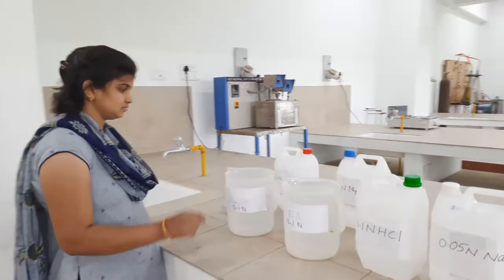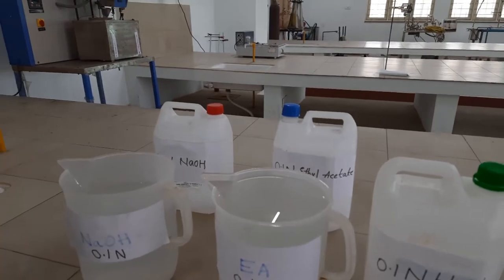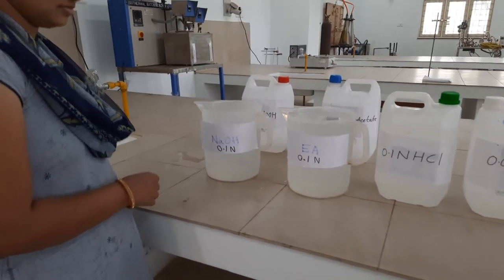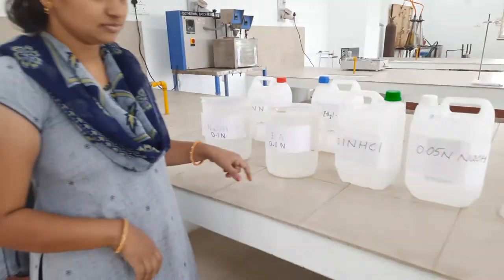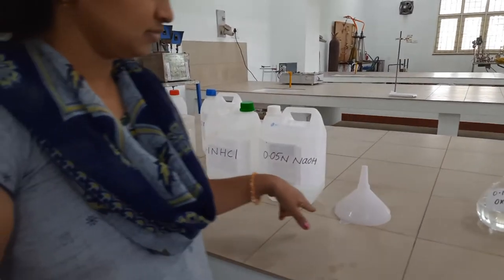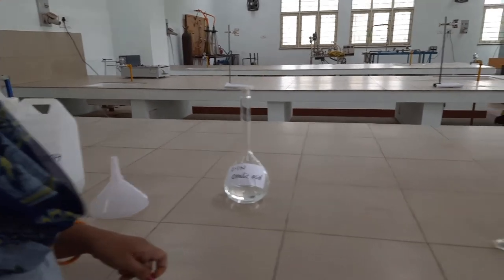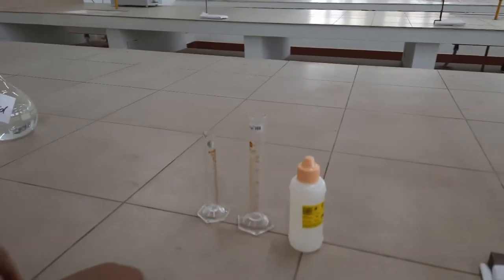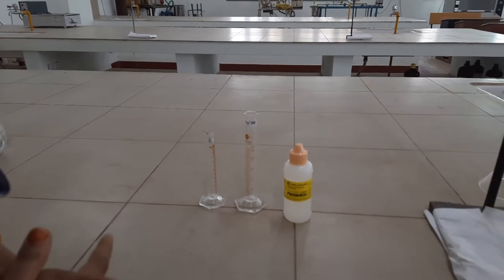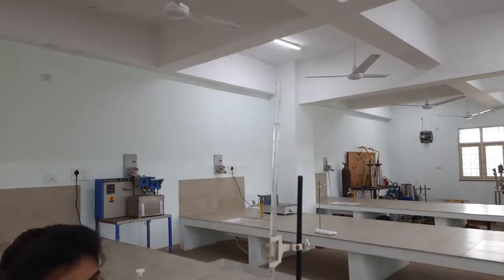Apparatus and chemicals required. To start with, for batch reactors, we prepared a small amount of 0.1 normal NaOH and 0.1 normal ethyl acetate. But for continuous reactors, we need to prepare more, so we prepared around 5 liters of 0.1 normal ethyl acetate and 0.1 normal NaOH. For titration purposes, we used 0.1 normal HCl and 0.05 normal NaOH, which needs to be filled in the burette. For standardization, we used 0.1 normal oxalic acid. For collecting the samples from the reactors, we have 25 ml and 10 ml measuring jars, and we are going to use phenolphthalein indicator, 2 drops, and we will take 0.05 normal NaOH in the burette, so we fill up to the zero.